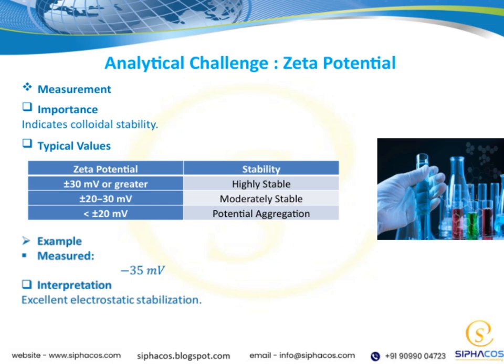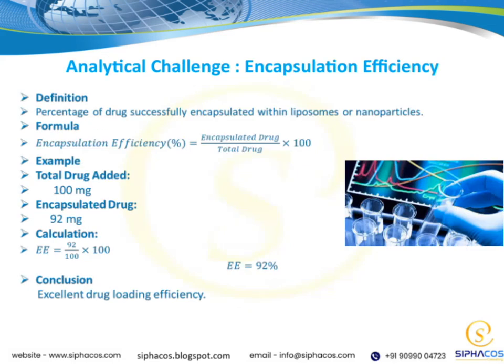One of the key challenges we face is encapsulation efficiency. This is all about how well we can trap or contain the desired material within a carrier or system. If efficiency is low, we lose valuable resources and the performance drops. So, improving encapsulation means better delivery, higher impact, and less waste. It's a critical hurdle, and solving it can unlock the full potential of our approach.